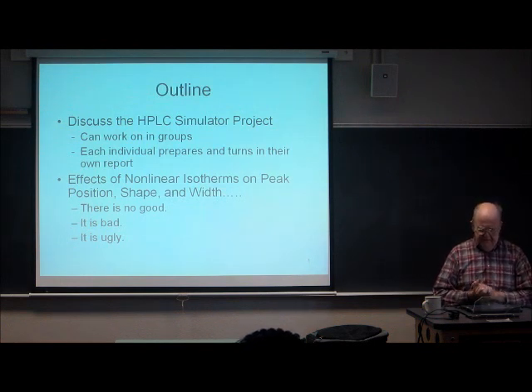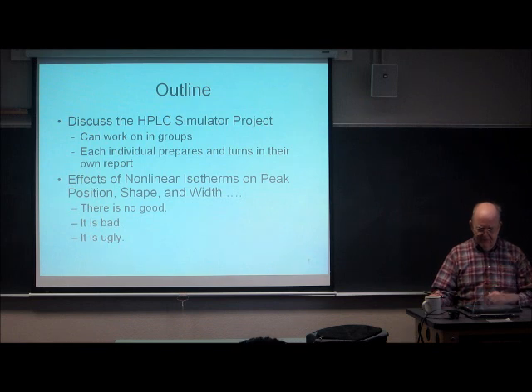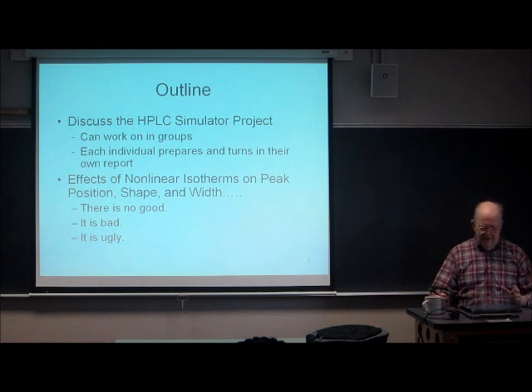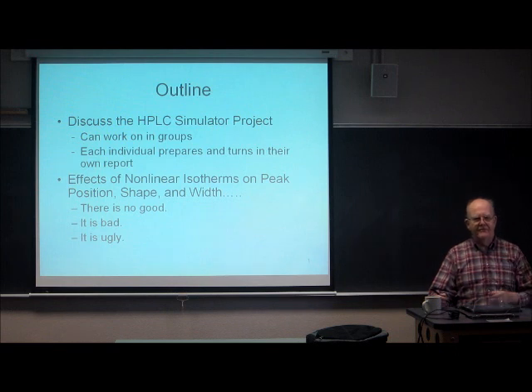We're not going to get into the mathematics of it at all. There's a wonderful book by George Guiochon on preparative chromatography. It's called Preparative Liquid Chromatography. It's about yay thick, close to 900 pages. It's a wonderful book. If you get into prep scale chromatography, you've got to have that book. I'm going to give you not what's in that book, but just enough to be dangerous.